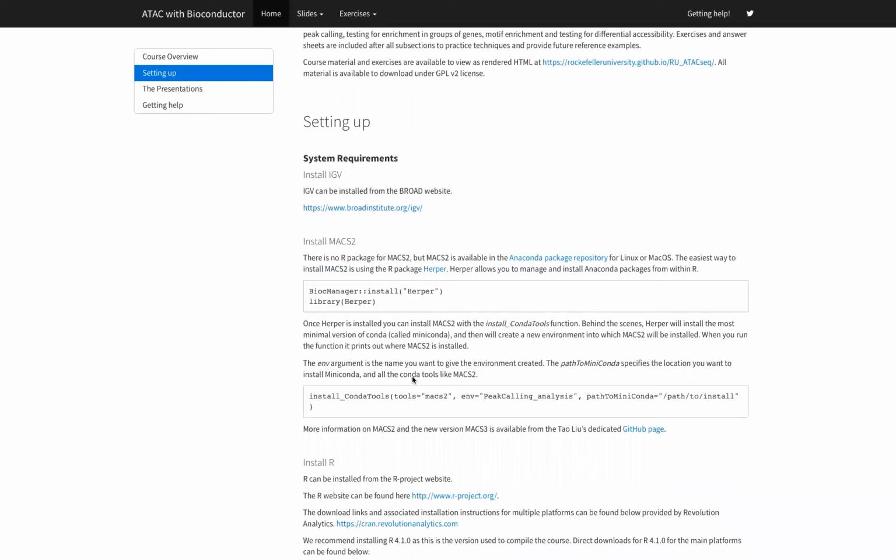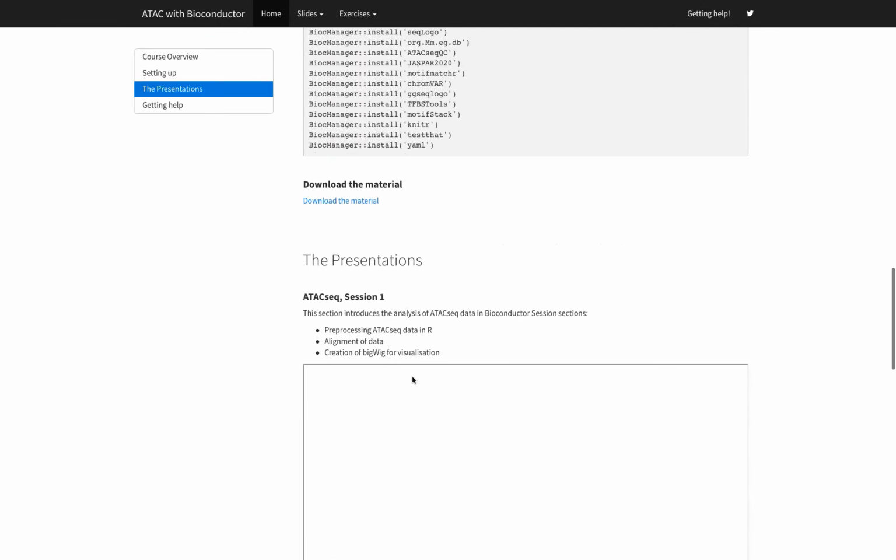So anyone here going to be doing ATAC-seq? You guys are going to be doing everything just as well.